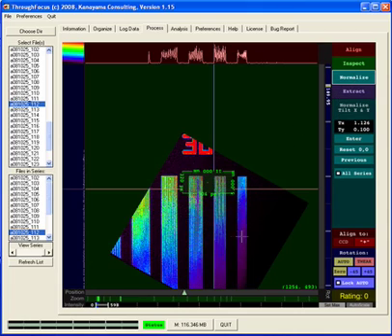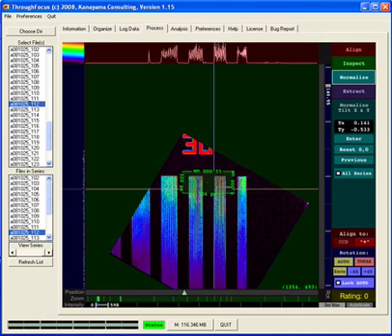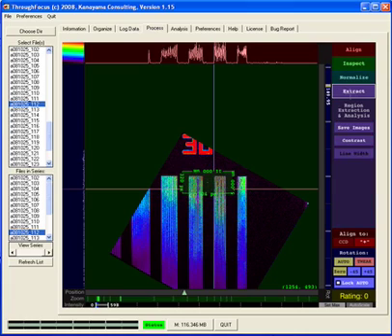Normalize. Okay, there, now it's working. So you can see I can balance the colors to try to get a good uniform illumination in the area. This is the only area that we care about. Okay, now let's extract the data.